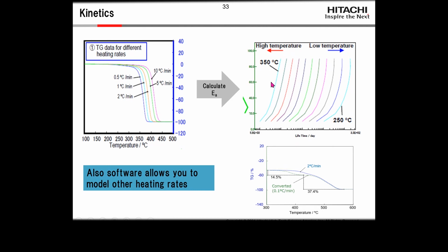And it's a fairly straightforward method. There's actually an ASTM method for it, and it gives you data very, very quickly compared to what running all of these as lifetime experiments would be. Because if you look at our scale down here, we're looking at the log of days. So these last data points out here are on the order of years.